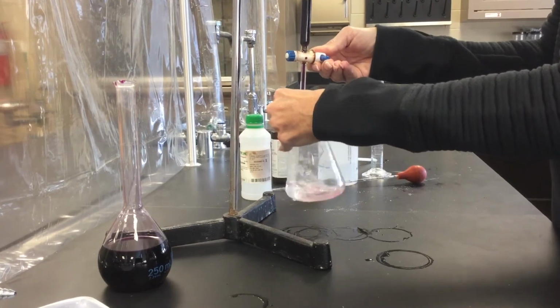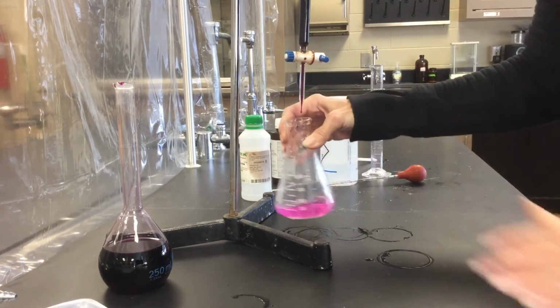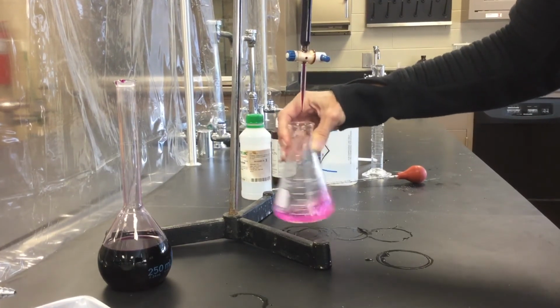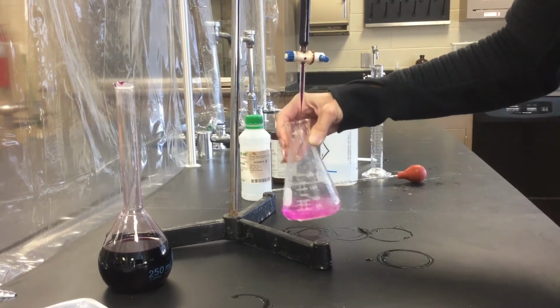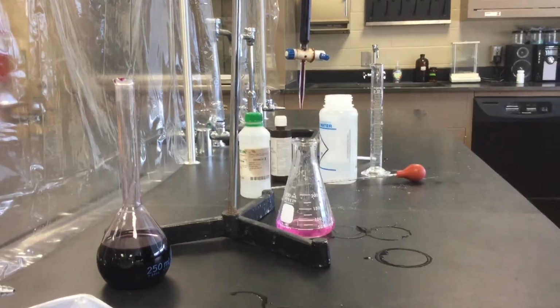Thought that one was going to stay. Uh-oh. Well, I think the first trial was actually better than the second trial. This one went from clear to a dark pink pretty quickly. Okay, well, first trial was better, but again, you're going to average those two. It's still not horrible. It's just not as good as the first trial.